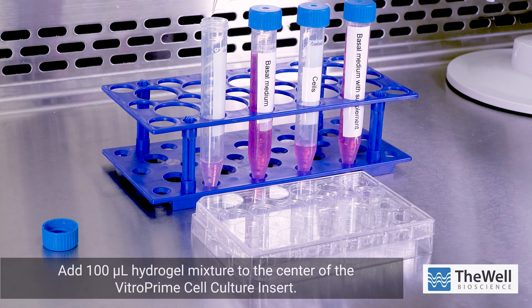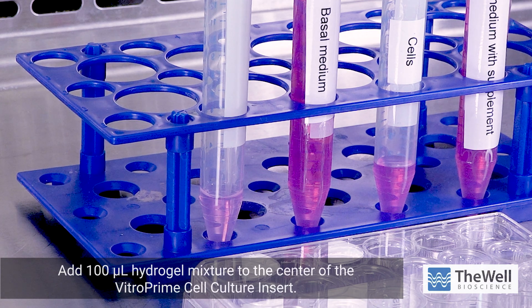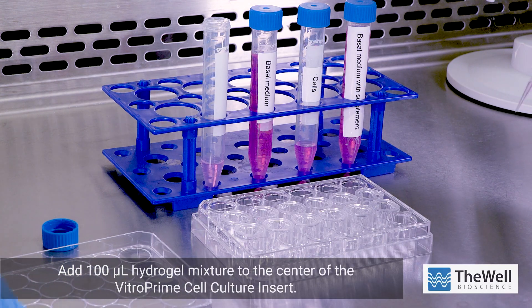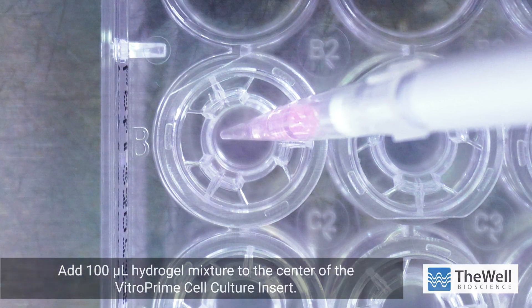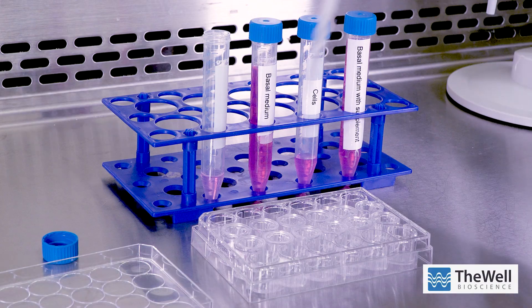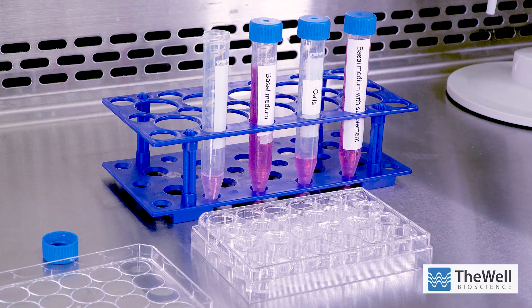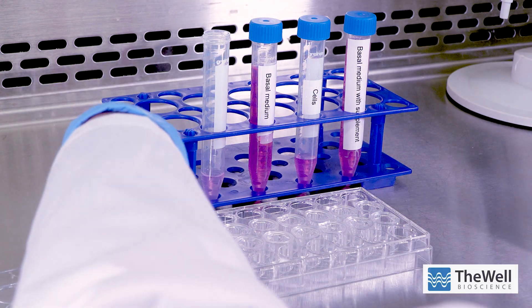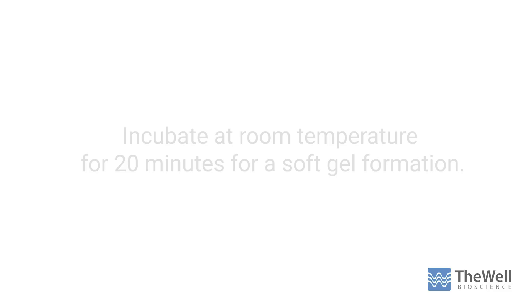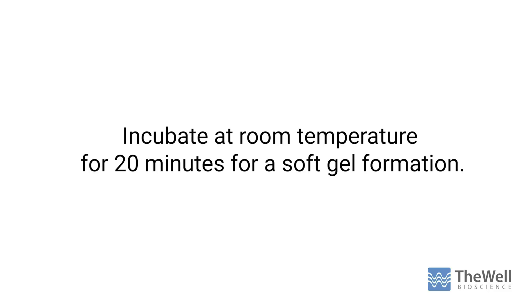Add 100 microliters of the hydrogel mixture to the center of the Vitro Prime Cell Culture Insert. Ensure there is an even hydrogel covering on the surface of the insert. Incubate the plate at room temperature for 20 minutes to allow for soft gel formation.